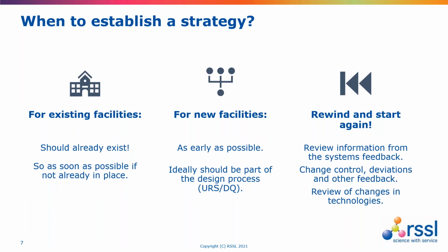So again, with many of these things, and it was the same point I made with the risk assessment webinar last month, all of these things need to be living, breathing documents. So we do need to continuously revise these things as things change. We're not creating these things for the sake of creating them and putting them on the shelves to gather dust. Not that we have dust in our clean rooms, I'm talking about the offices.